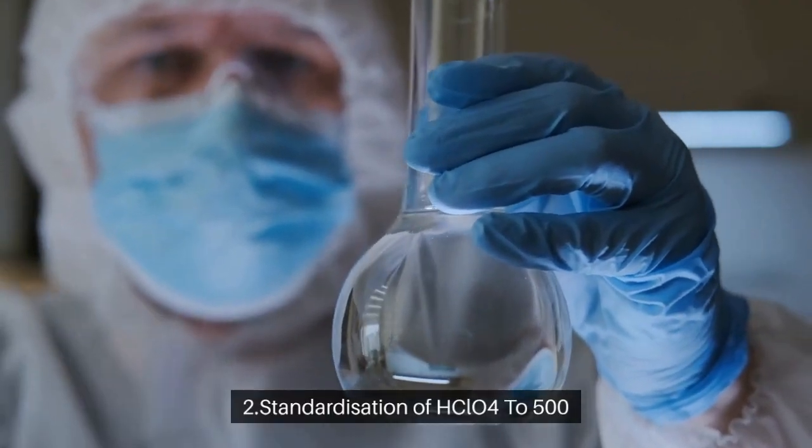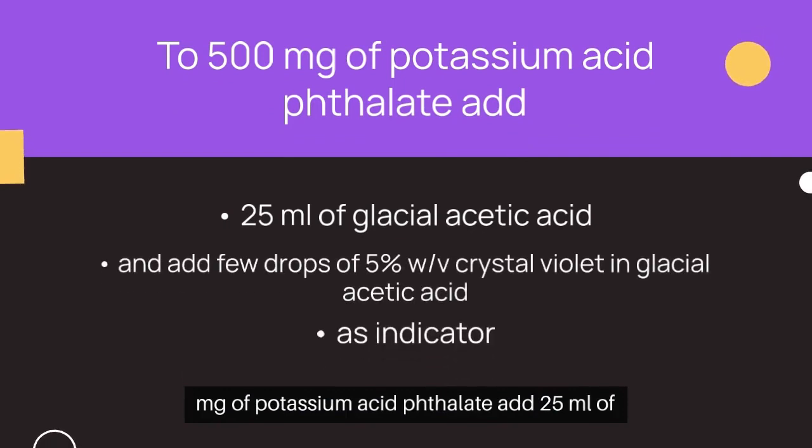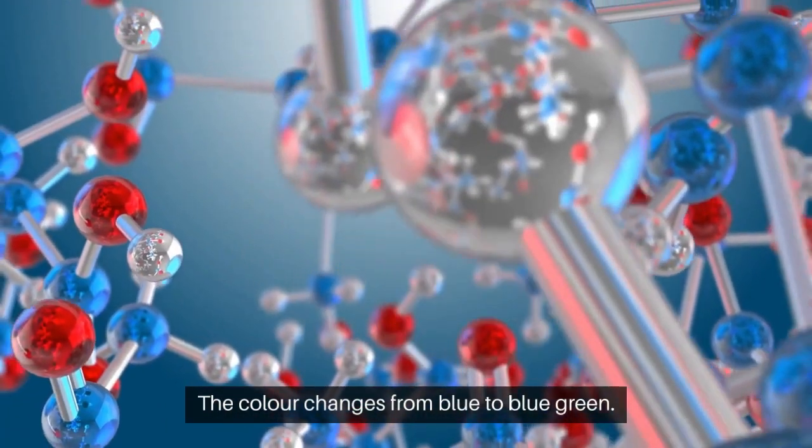2. Standardization of HClO4. To 500 mg of potassium acid phthalate, add 25 ml of glacial acetic acid and add a few drops of 5% w/v crystal violet in glacial acetic acid as indicator. This solution is titrated with 0.1 N HClO4. The color changes from blue to blue-green.